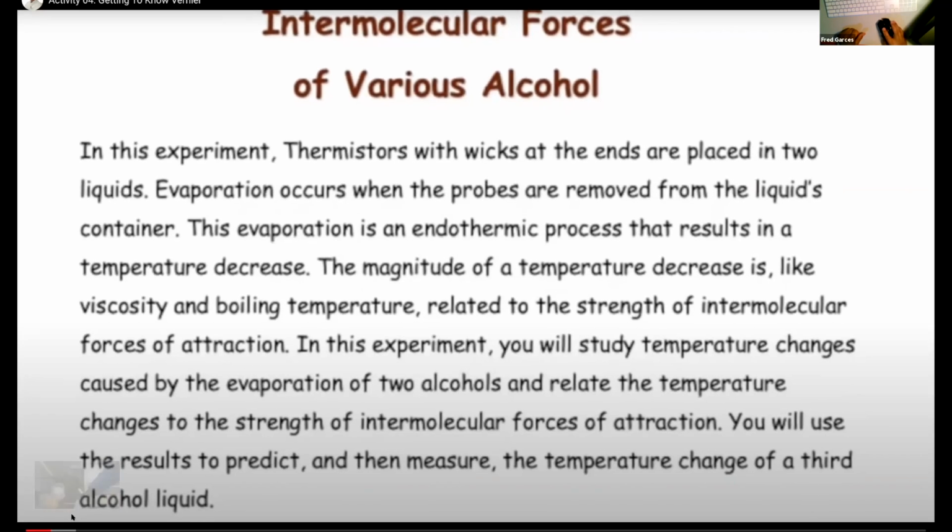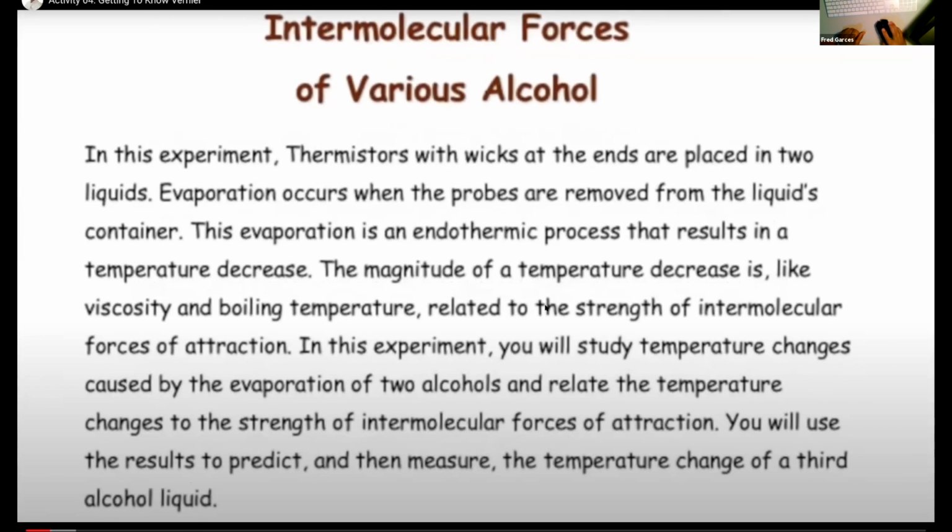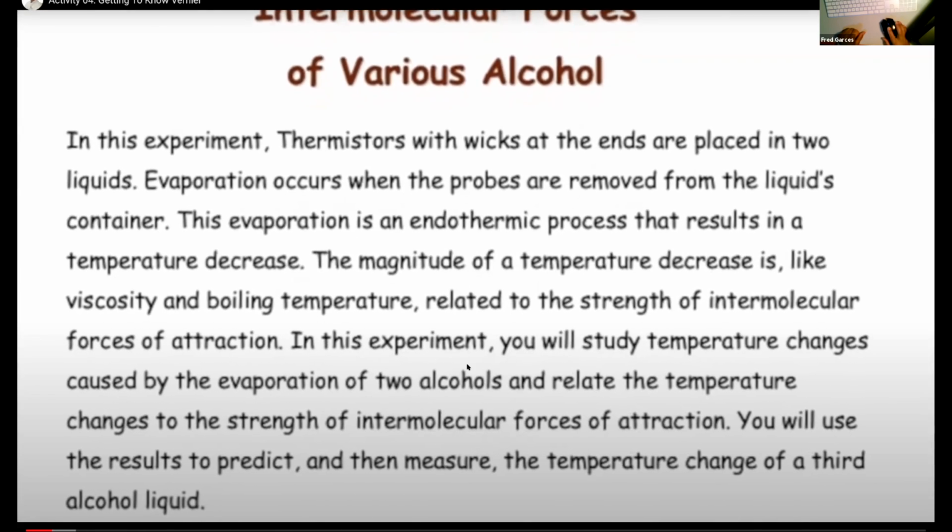basically go through this. Read this introduction, because this is my PowerPoint. This one especially, because it pretty much tells the heart of what this experiment's about.